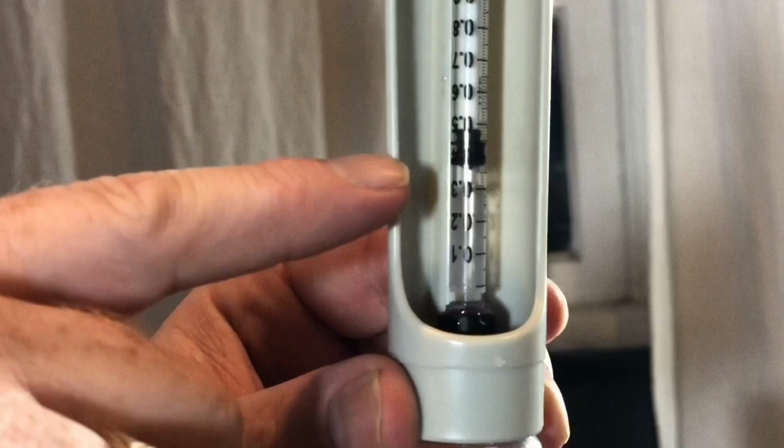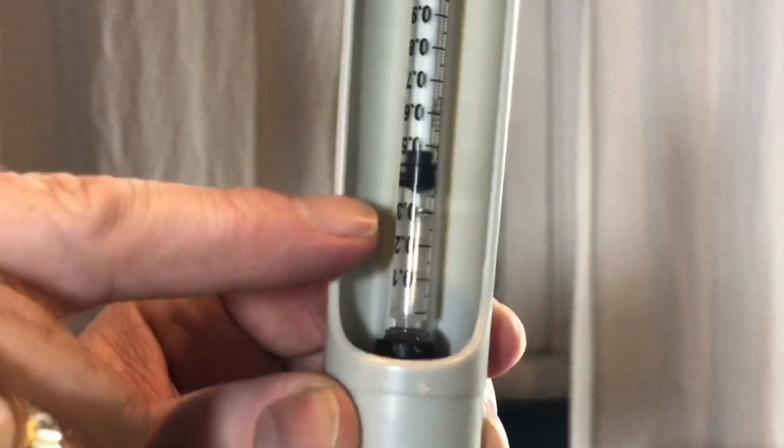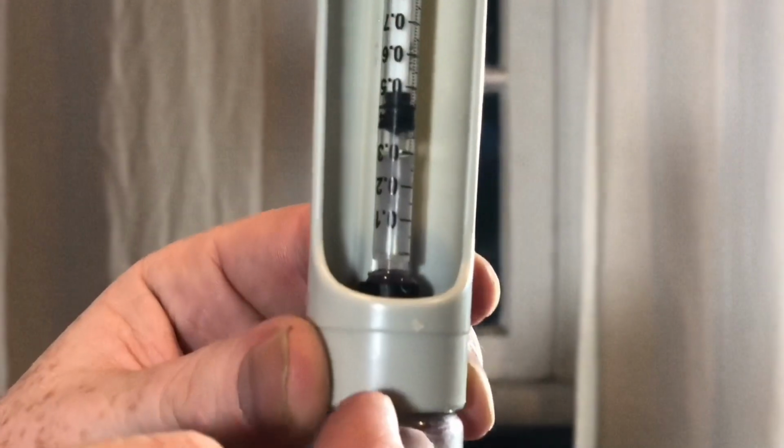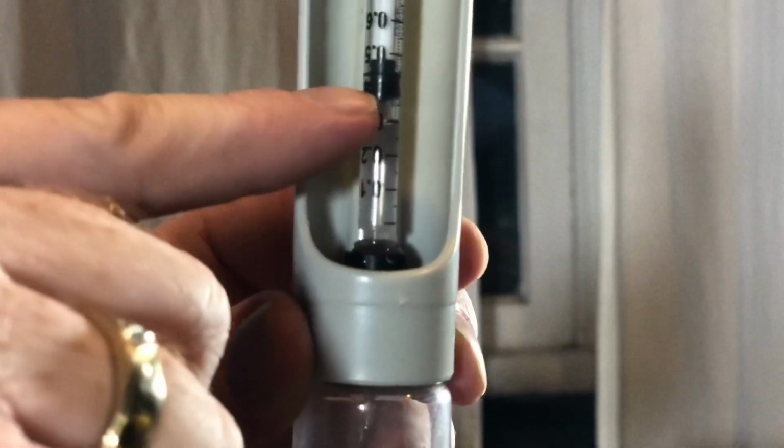You can see where the plunger is at the 4. The liquid's at the 3, once again, because there is 0.1 of a mil in the actual nib itself, we read to the plunger, so it's reading at 0.4. Go to the back of your card here, so it goes from how much you've used, so I've used from 1.0 to 0.4, so I've used 0.6.